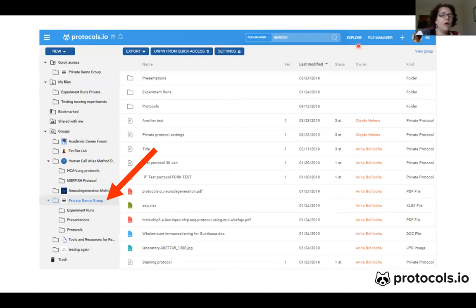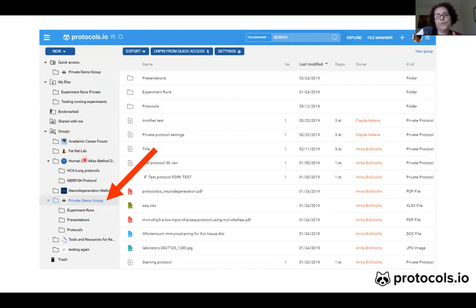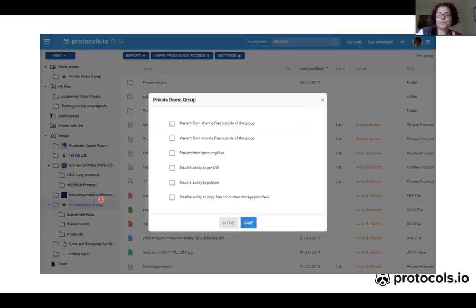Here you have access to all your files — everything that is in your Protocols.io account. You have your personal files here, and then you have a group folder with a subfolder for each one of the groups that you are a member of. Here is the private demo group folder, and if I right-click on this folder you can adjust the folder settings.